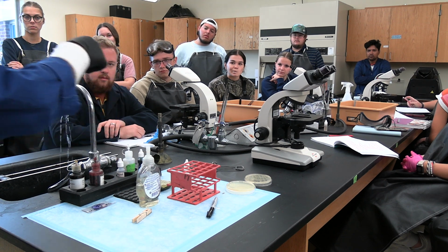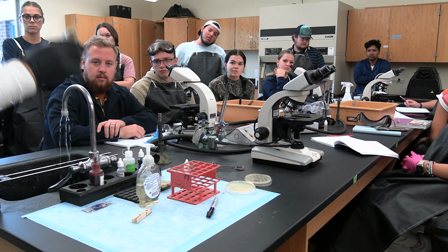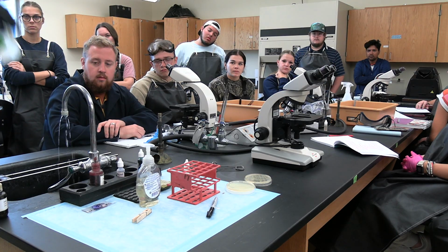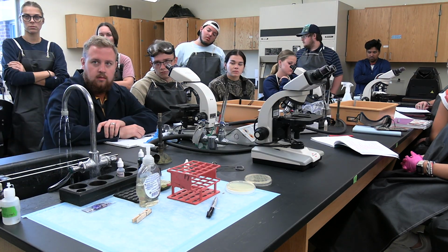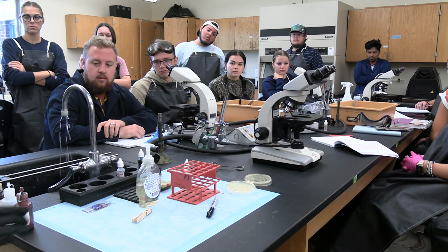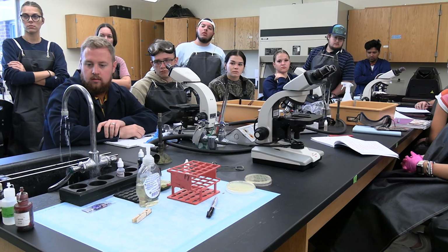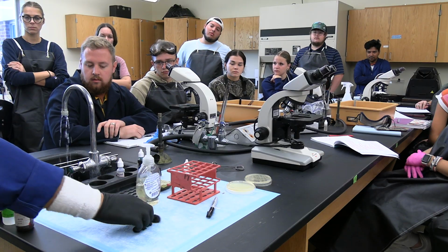The first time you do it, you may not be very familiar, so put them in order: crystal violet, followed by gram iodine, then 70% alcohol, 95% alcohol, then counterstain with safranin. Also prepare some paper towel for the last step when we do the drying procedure.